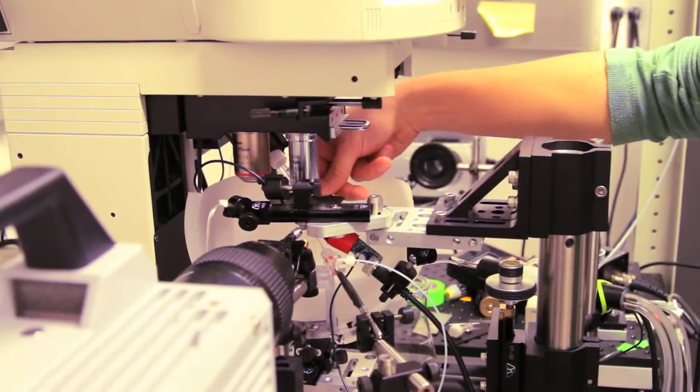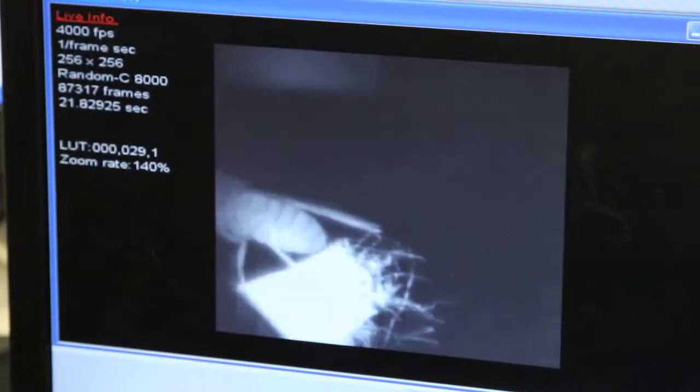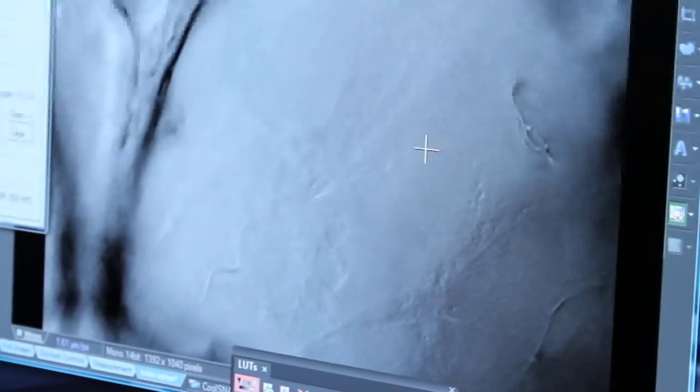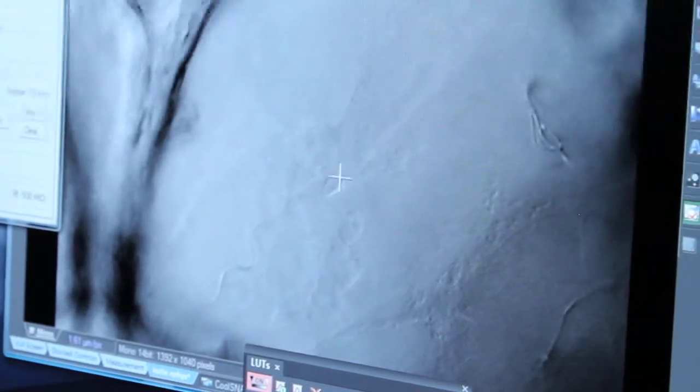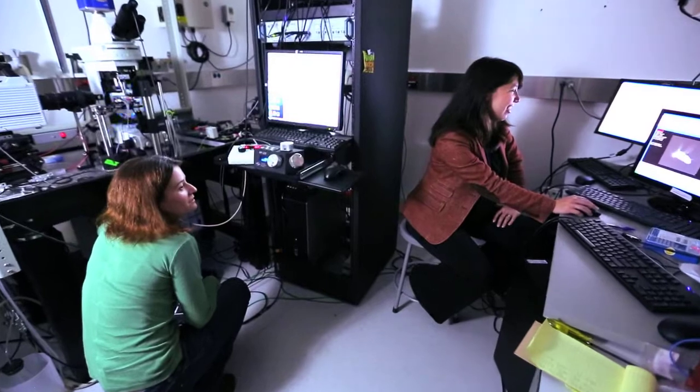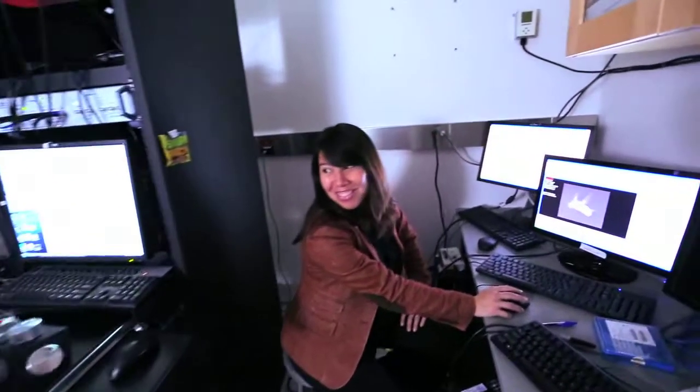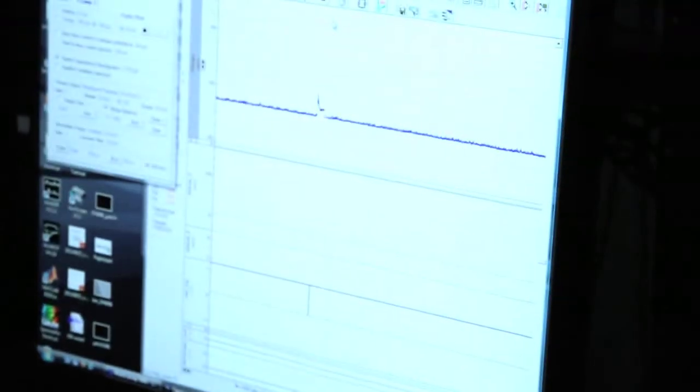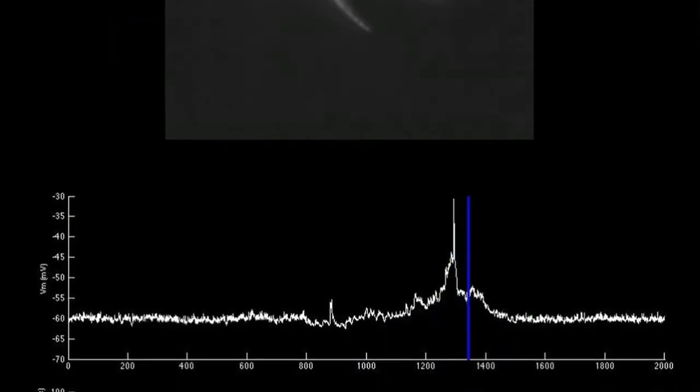One fly at a time is put under a microscope so that we can zoom in on its brain and really try to pick out an individual neuron that we want to target for recording. Three, two, one, click. Got it. So we can actually compare when the giant fiber spike time is relative to when the fly behavior occurs.